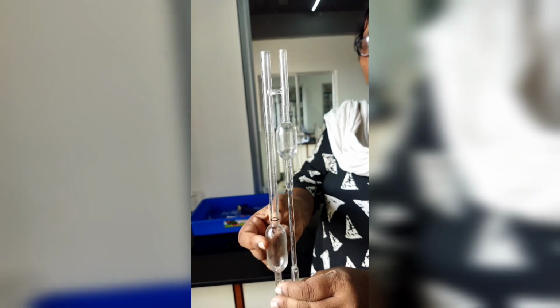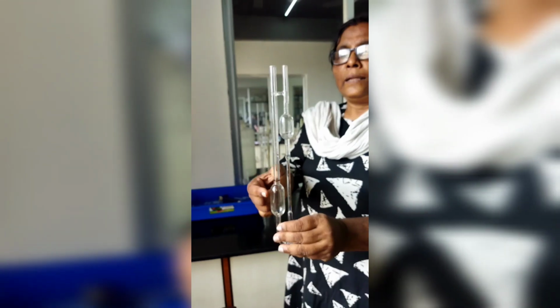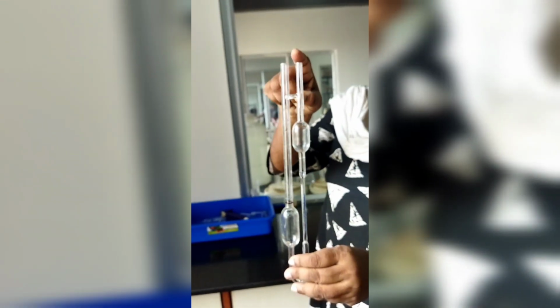If these 2 bulbs are full, then the level cannot be maintained properly. Better is that you fill this much, draw it up to the upper level. When it comes down, again this much, it will be refilled up to that level. In that way, we will be able to maintain an equal pressure head.